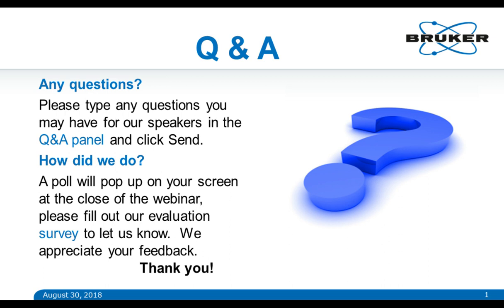Okay, I'm happy to answer this question. I think it's vital. If you don't standardize, you will never get anything meaningful. But as it was already pointed out both by you and by Elaine, NMR is a powerful tool, because if everything else is done properly, from the pre-analytic procedure to the analytic procedure to the preparation of the sample for NMR itself and the way the spectra are acquired, NMR is probably the best technique in terms of quantification, reproducibility, and so on and so forth.